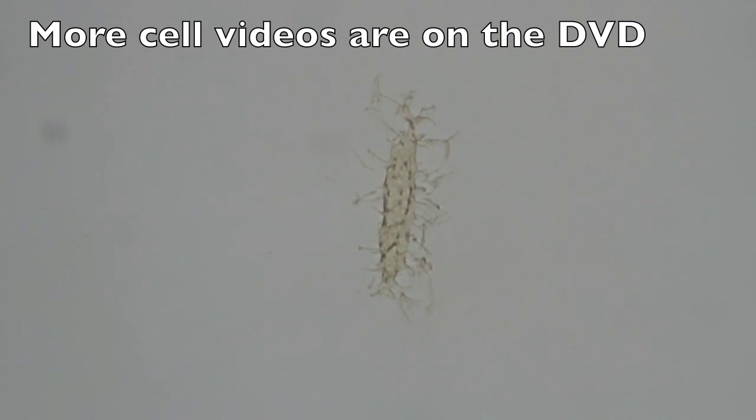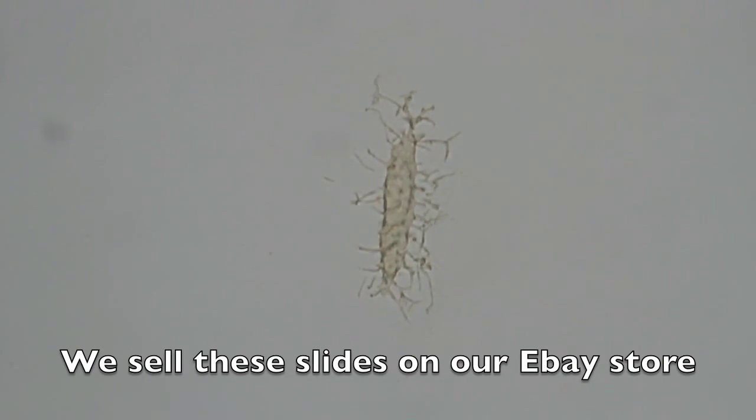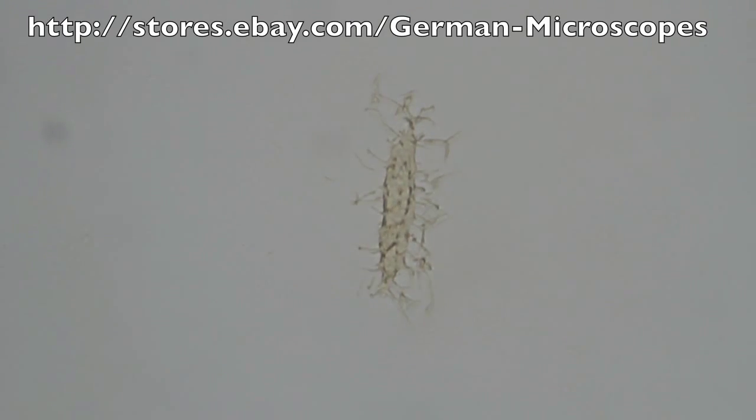Those last videos showed the cells a little out of focus, so I'm going to go all the way up using my 100x oil immersion objective and show you this beautiful cell with all of its beautiful and delicate filipodia at the highest possible magnification.